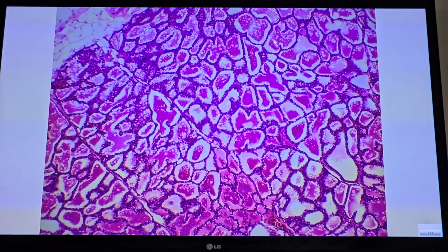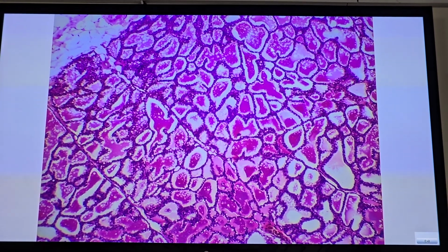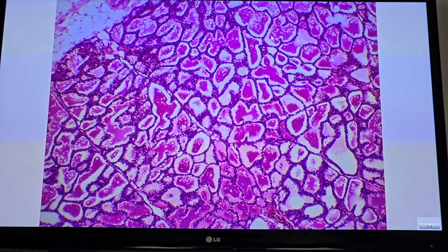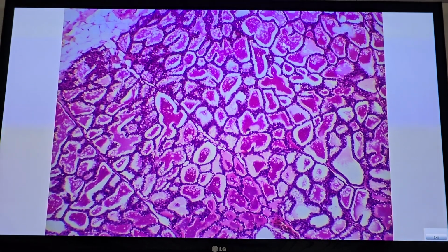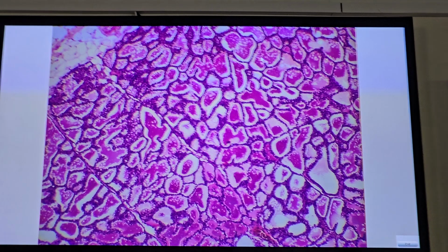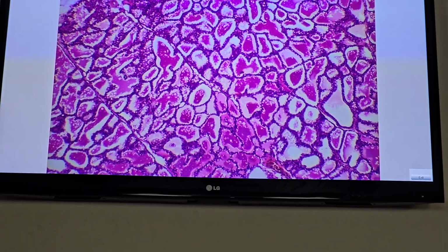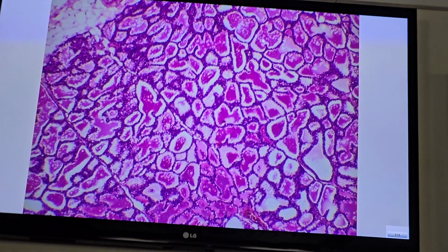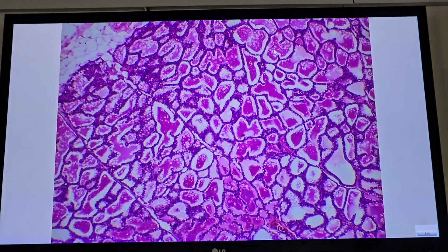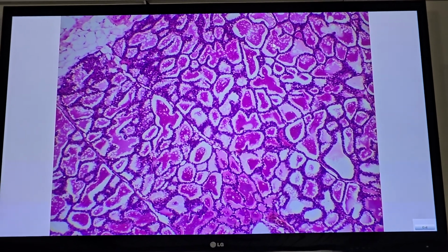In mammary gland during lactation, both the secretory portion and the duct are filled with nutritive milk, acidophilic milk with vacuoles. The question picture is different from the first, no, the same. All slides are stained with hematoxylin and eosin except for the vagina stained by trichrome stain. You recognize trichrome as it will be green. So this is very important, consider that all the slides are coming. Okay? That's it for the lab.